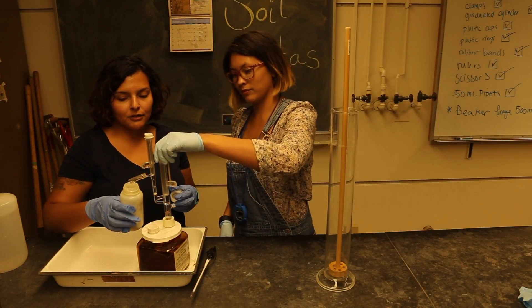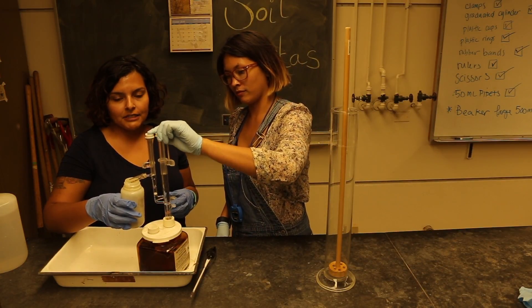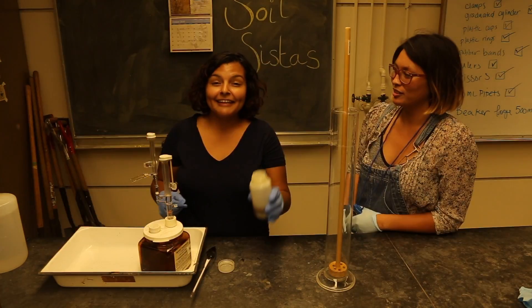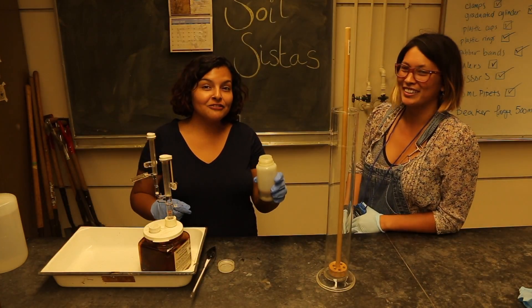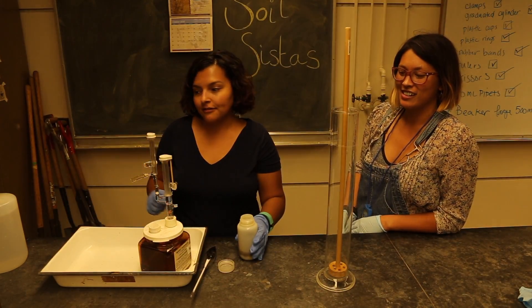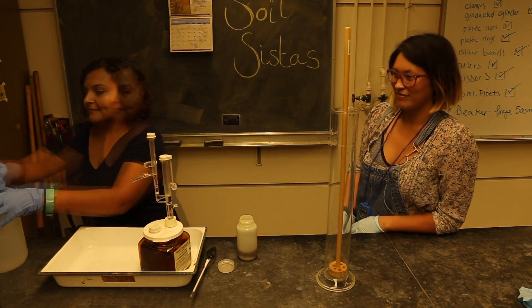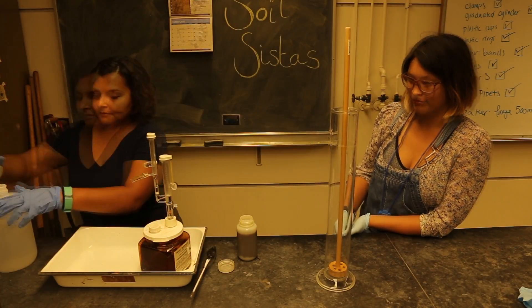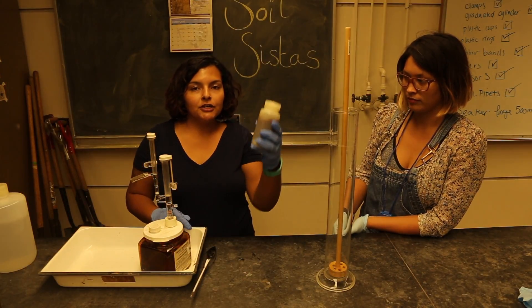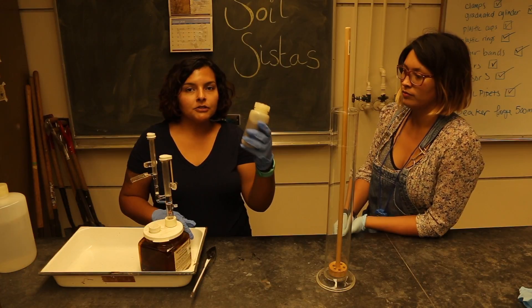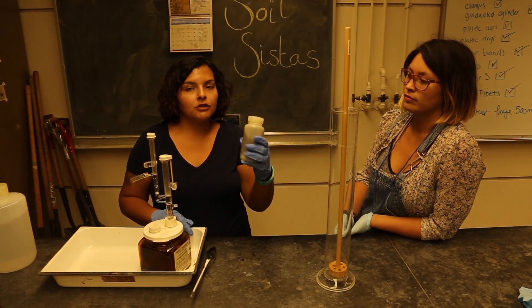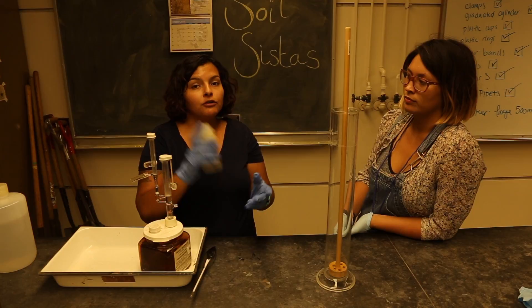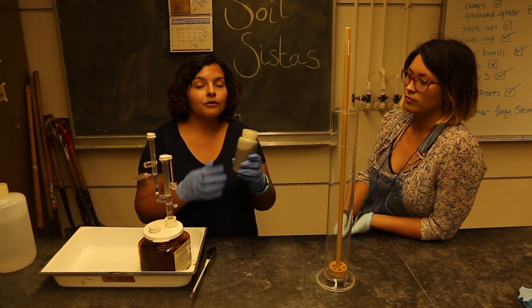We'll add 25 ml of SHMP and then 100 milliliters of water to this jar. So in here we have our soil, the SHMP, and 100 milliliters of water, and now we need to shake it vigorously for three to five minutes.